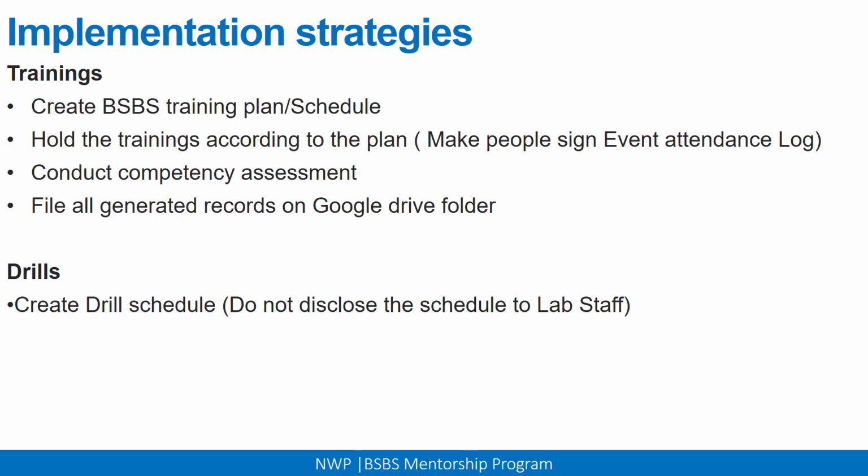Of course, after you conduct the drill, you need to indicate whether you did it. So you indicate either completed, not done, or pending. Then do not disclose the schedule to the laboratory staff. That way people will respond the way they would respond in case there is an actual emergency. For the initial drill, you may inform the laboratory staff because maybe you just did a training on how to do a fire drill, and therefore you may inform them to say we are going to have a drill next week on such and such a day.